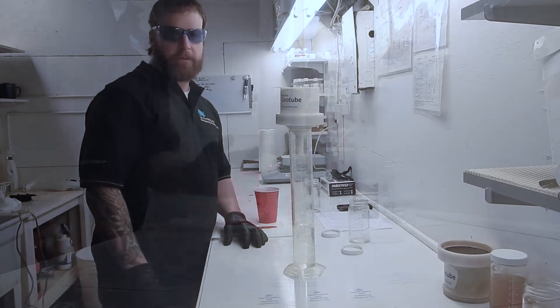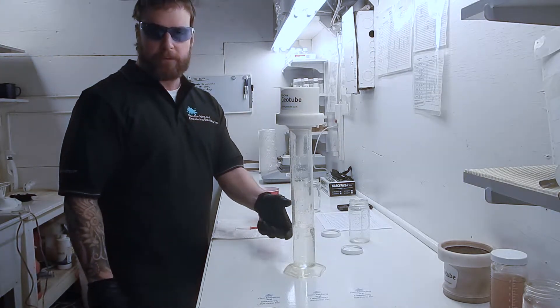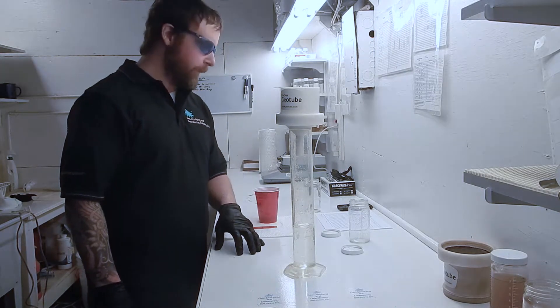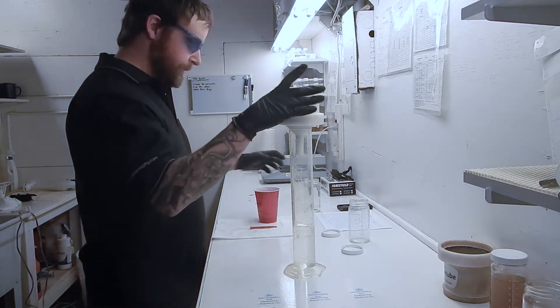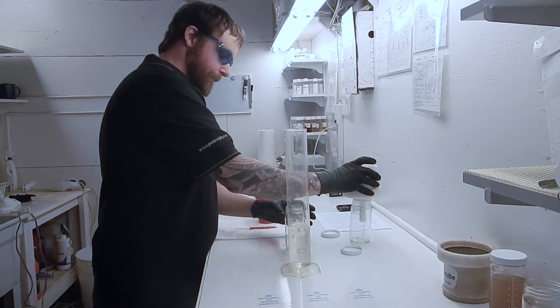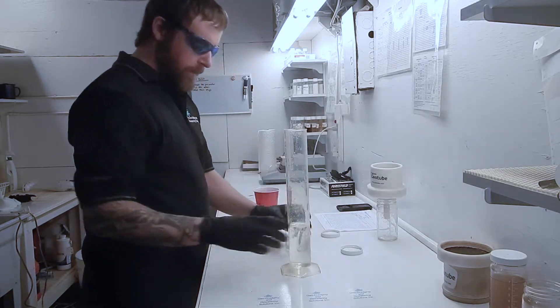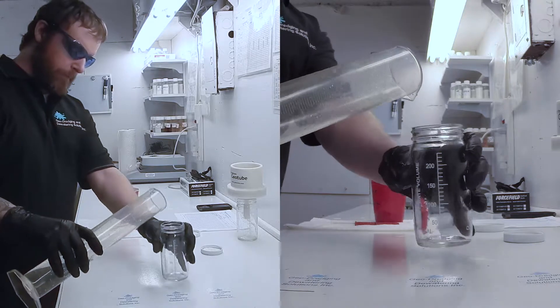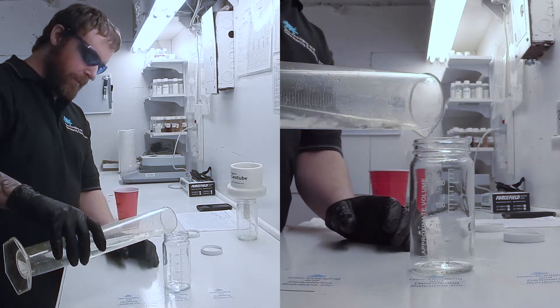Once you've timed out for a minute, you'll then take the amount of effluent you've collected in the graduated cylinder and record that number. We'll then take our effluent and pour it into a clean graduated jar.